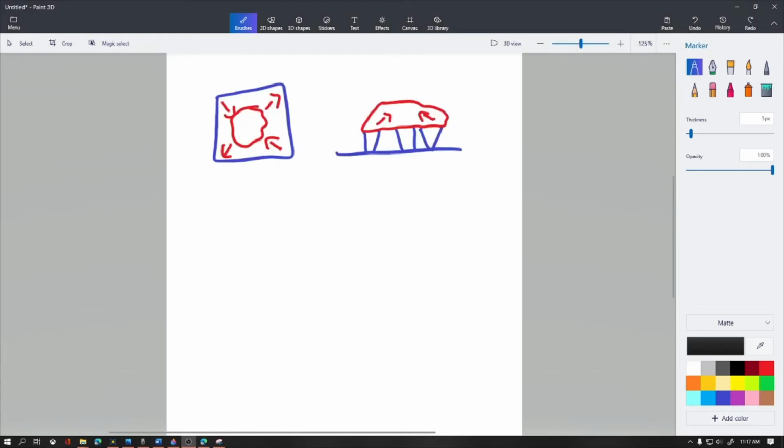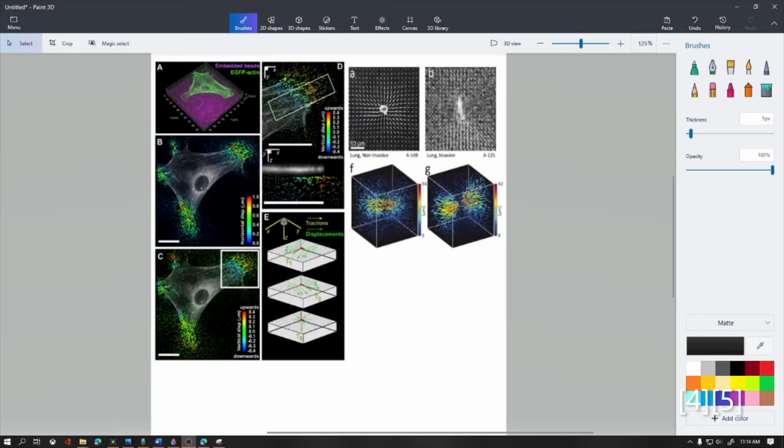All the methods I've described so far are the 2D methods, and they are the primary methods, the most popular methods, involving a cell on some substrate on a glass slide under a microscope. 3D techniques are currently mostly similar to 2D methods, with an added layer of complexity. Some of these so-called 3D methods are simply the same 2D setup, using more computationally intensive image tracking of these microbeads in a certain depth of field, and reconstruction of these 2D features in a 3D generated space.